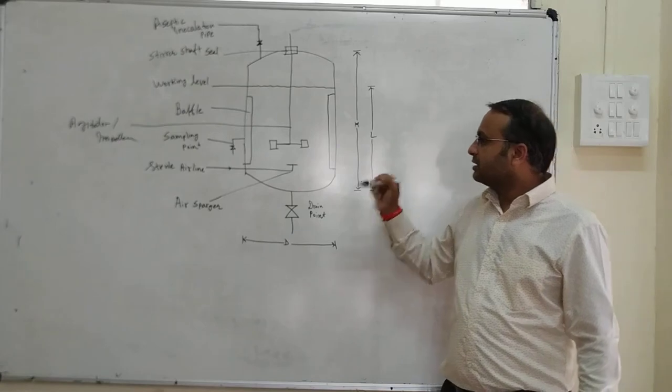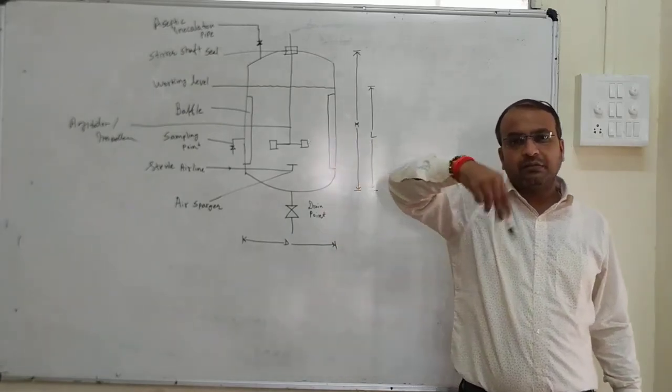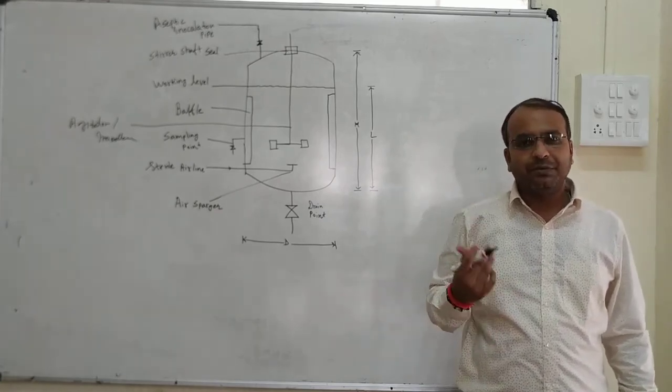Now the other thing is, whenever we are mixing something in a circular manner, it leads to the formation of a vortex. You can experiment with this as well.